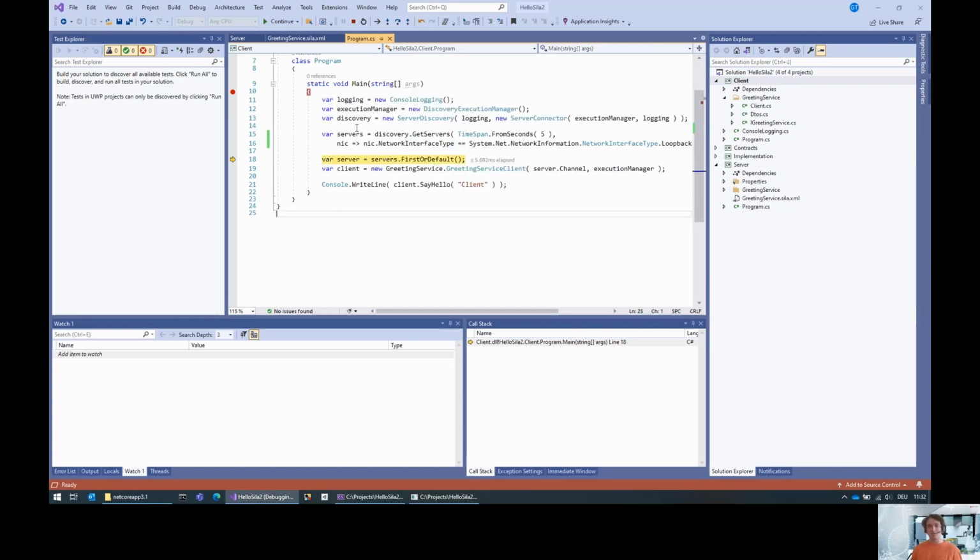And how does that work? The problem is that the Tecan SiLA 2 SDK uses the native gRPC implementation. And this native gRPC implementation only accepts connections where you know the certificate authority in advance. And this works because the server announces the certificate that it is using already via discovery. And that is why you can manage to connect to the server.